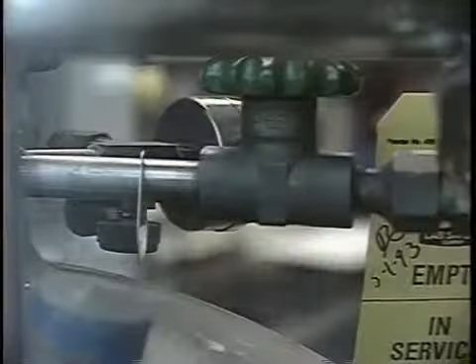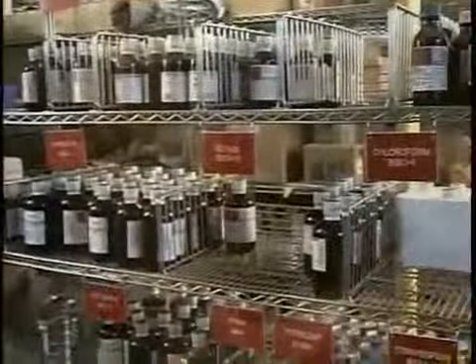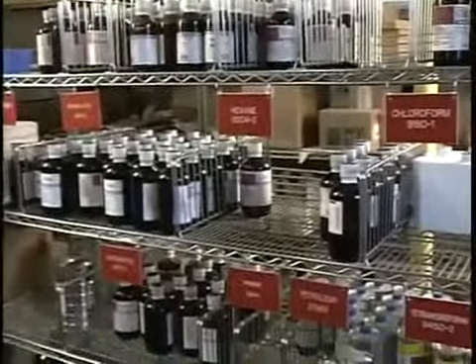But what if something goes wrong? A leak, a spill, or even a fire? Every chemical has different hazards. How should we deal with them in an emergency? Fortunately, the answers to these and other important questions can be found on a Hazardous Chemicals Material Safety Data Sheet.